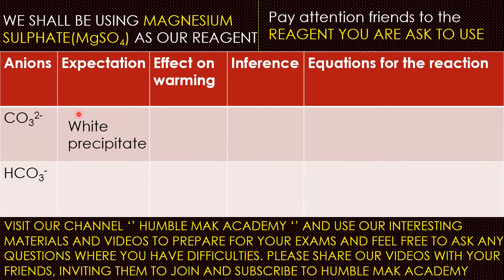Good. So now guys, the effect on warming: if we heat it, guys, we will not see any change. No change will be observed. The white precipitate remains a white precipitate. Then now guys, the inference, what do we say now? That the carbonate ions are present.